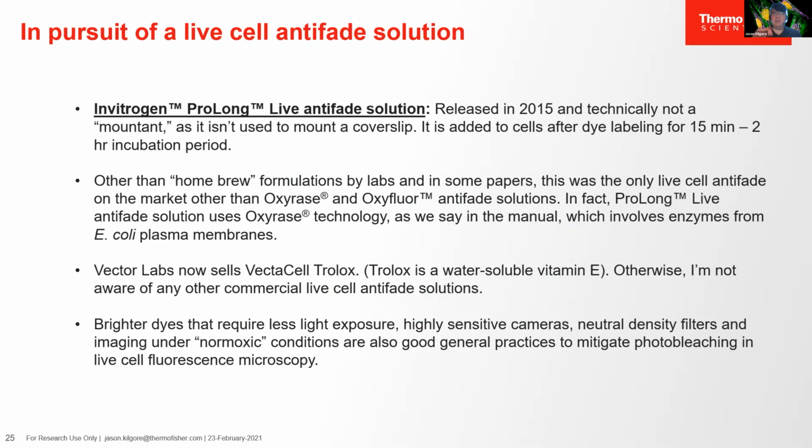Well, we licensed it to Thermo Fisher and improved upon it, and now we've released that as ProLong Live, where you add it to your media and let it sit for 15 minutes up to 2 hours. And then you would label beforehand, preferably, but you could label after. And it will protect dyes to a large extent. This was released in 2015. Vector Labs also sells Vectacell Trolox, which is a water-soluble vitamin E that has some antioxidant to it. Trolox isn't very good. I haven't tested their product, but I'm skeptical.